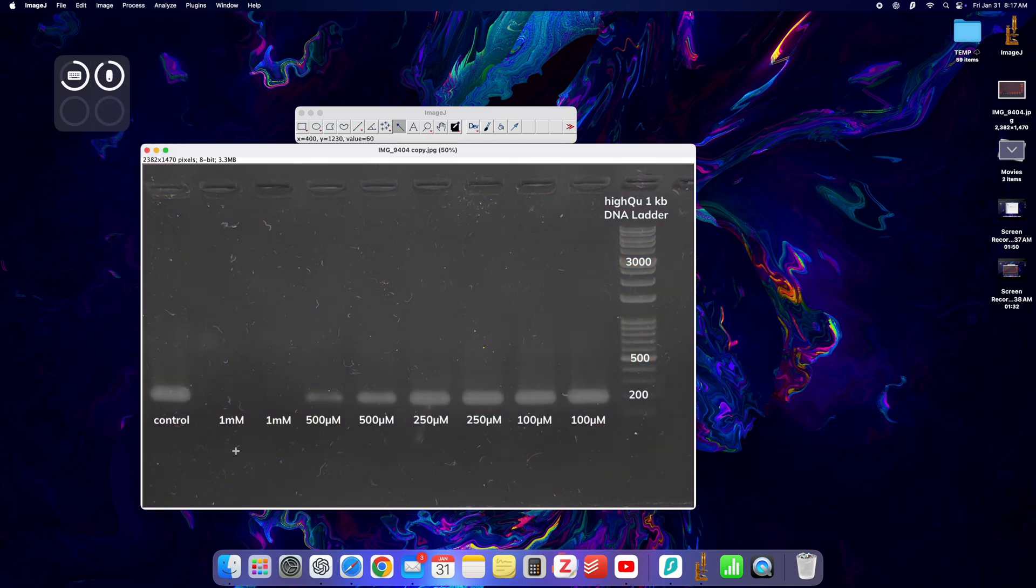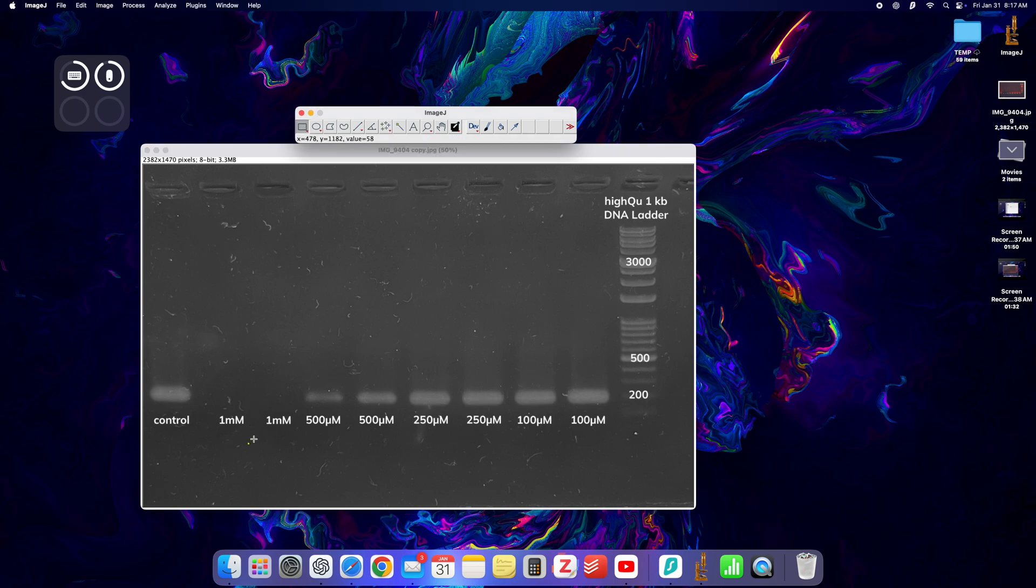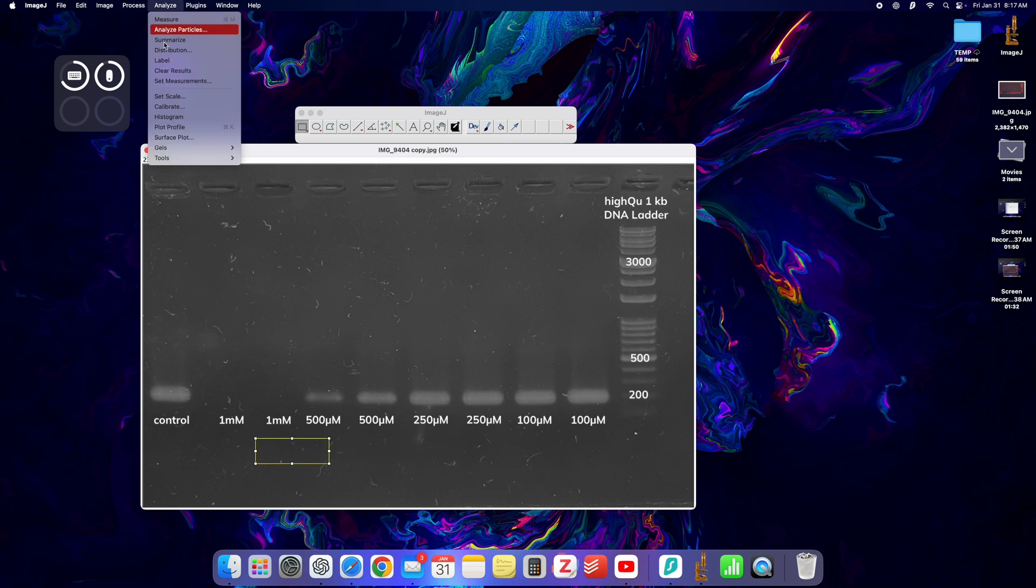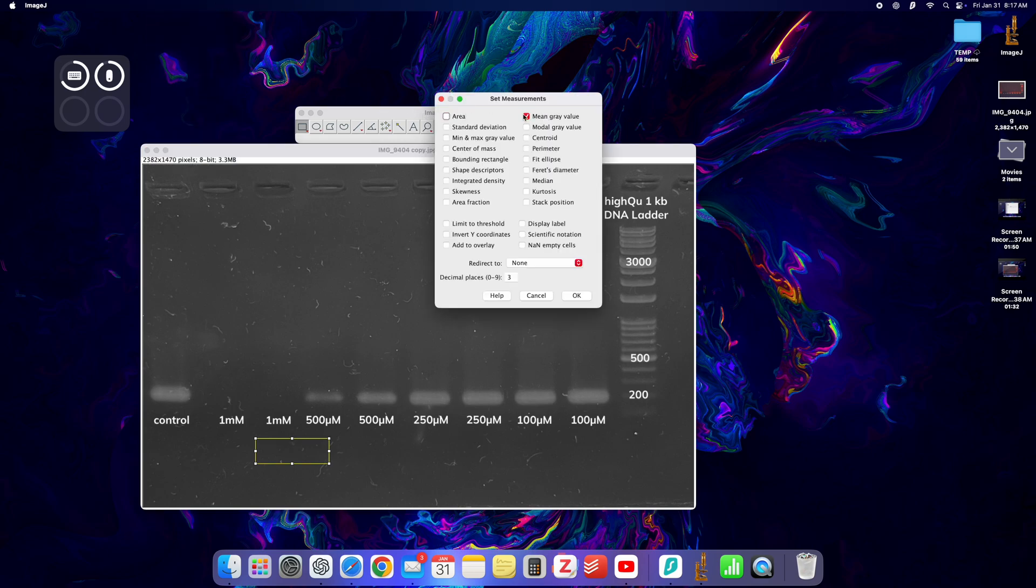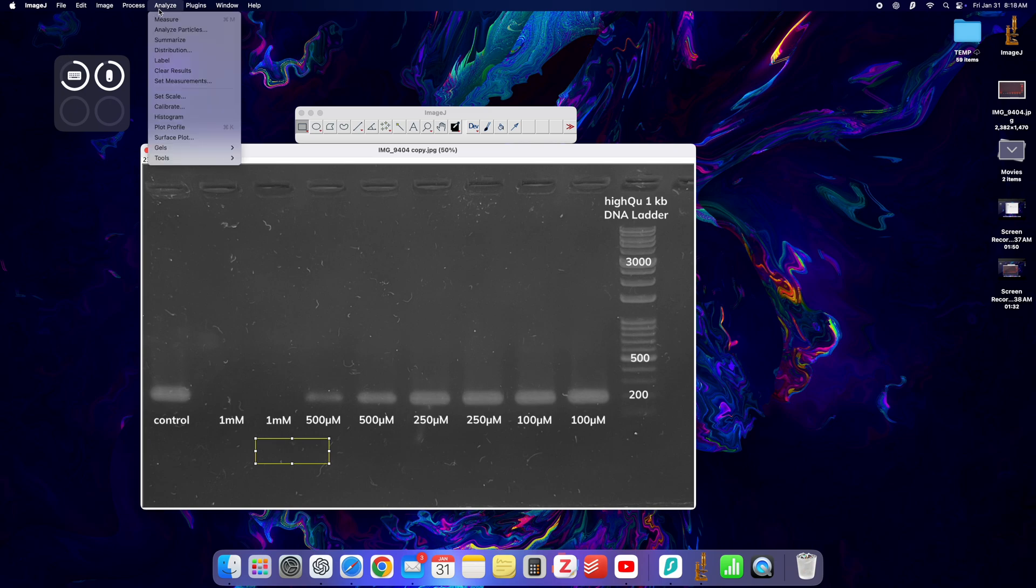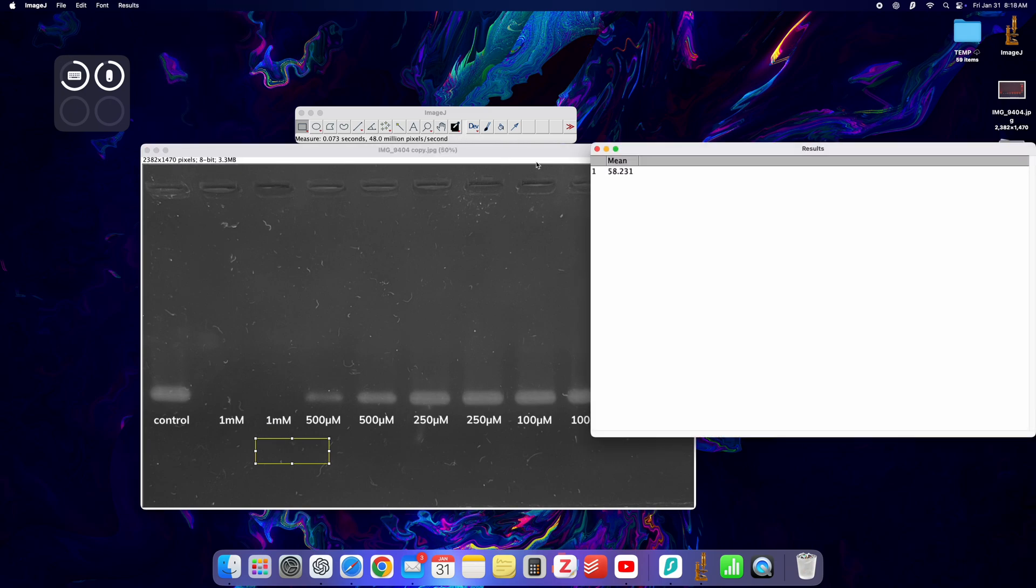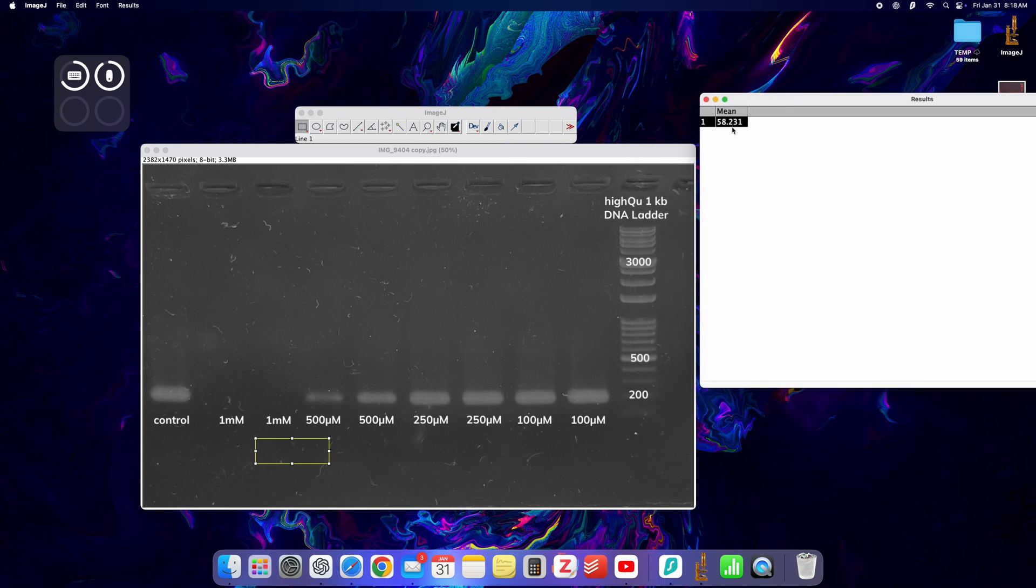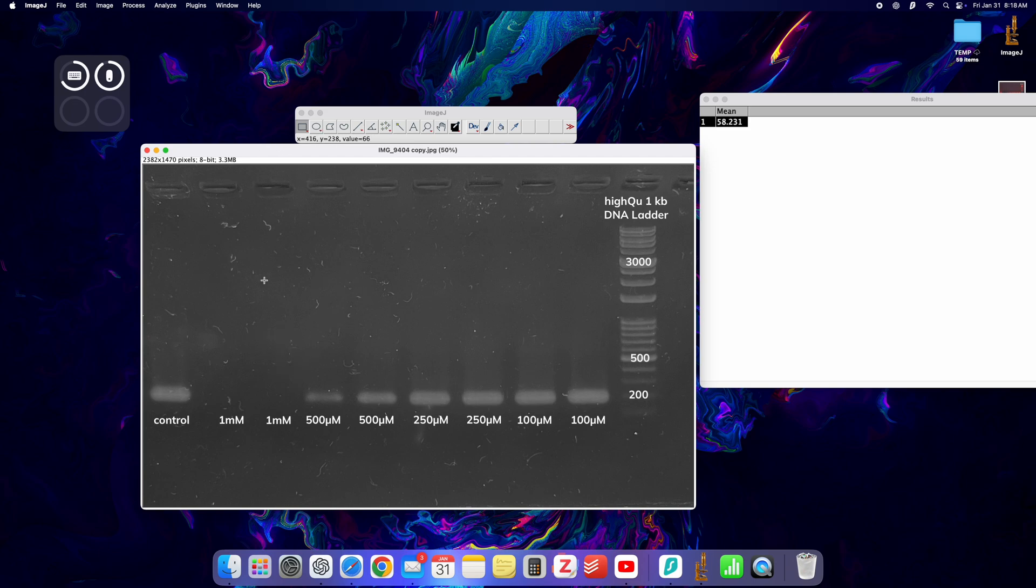The next thing I'm going to do is just subtract the background so we get a clearer image. What I'm going to do is select the rectangle tool, select a portion of it, I'm going to go to set measurements, I'm going to select mean gray value. Then I'm going to analyze measure and I'm going to remember this number right here, 58.231.